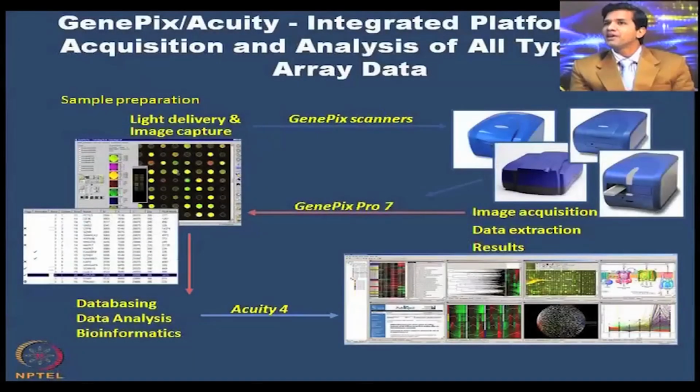In the form of hardware, as we have discussed, there are a number of different hardware possibilities in the form of GenePix, right from 4000B to 4300, 4400. These are actually the hardware part which allows the lasers to scan the chip. Once we are ready with the chip, it will be an interface between the CPU and the system which allows the data acquisition to happen, and GenePix is attached with software called GenePix Pro, which helps in understanding how data is acquired with the hardware.